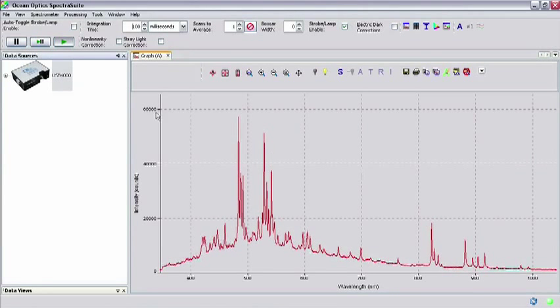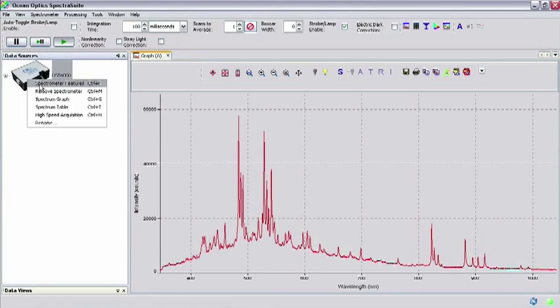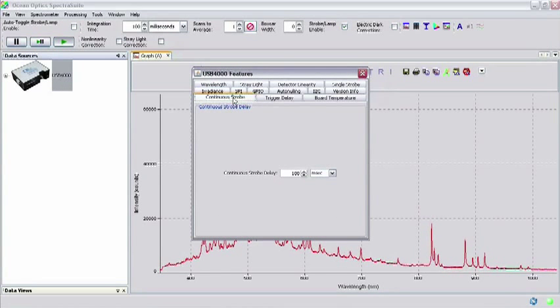If you're using multiple mode, select Spectrometer, then Spectrometer Features. Click on the Continuous Strobe tab and enter the Continuous Strobe Delay. Be aware that the Continuous Strobe setting will be reset to the default if you go back and change the integration time.